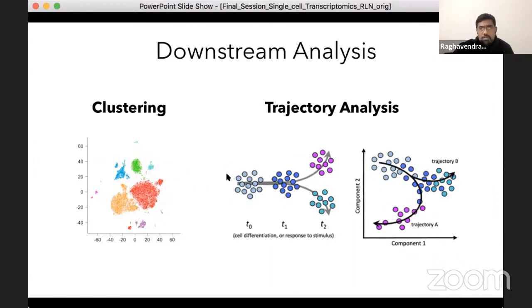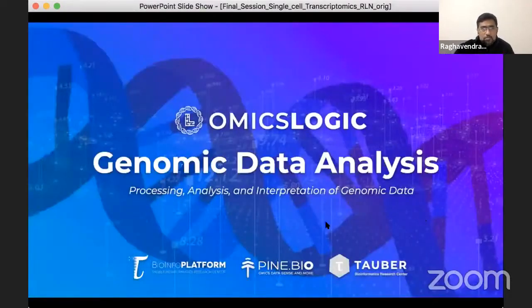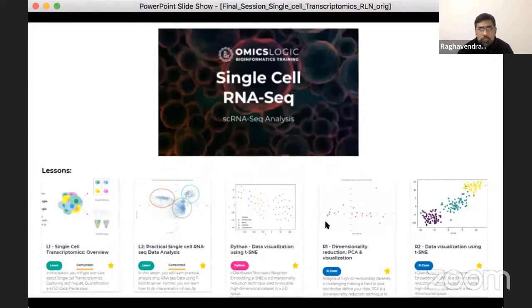All these analysis methods, the logic behind them, the choice of algorithms, how to run these algorithms, and how to perform the downstream analysis are discussed in much greater detail, in a logic-based and modular way, on the OmicsLogic platform.